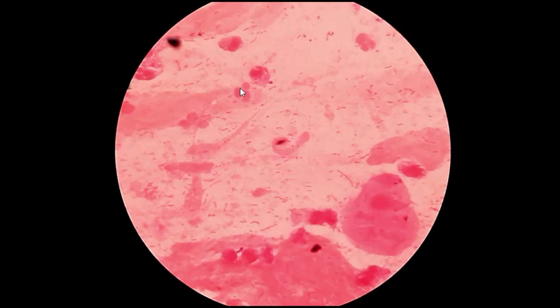Images at the 100x objective. So they are 1000 times greater than their actual size. So here you can see, this one is the pus cell, this one is the epithelial cell, and these are bacteria. This one, this one, this one, this one.